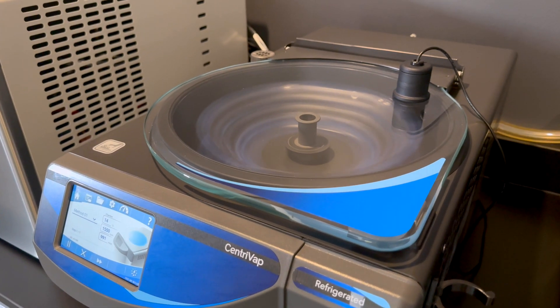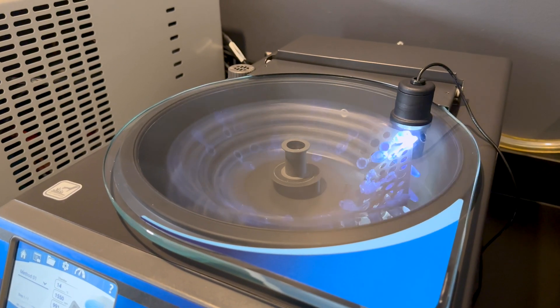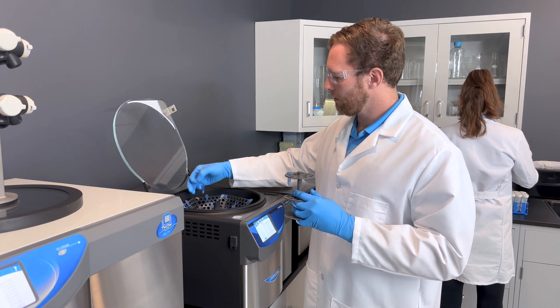The Centrivap Pro combines centrifugal force, vacuum pressure, and heat to rapidly evaporate solvents from your laboratory samples. This allows for quick and efficient concentration, saving you valuable time and effort.